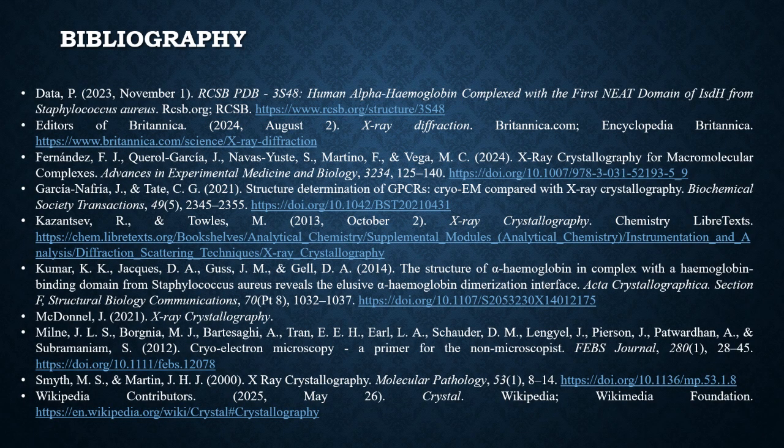To summarize, X-ray crystallography is an important technique in the determination of protein structure through its principle of diffraction. Once determined, these structures may be further studied to acquire information on protein function or interactions with other proteins.